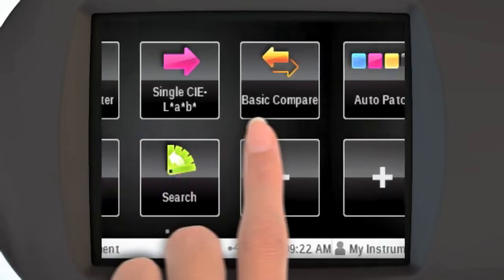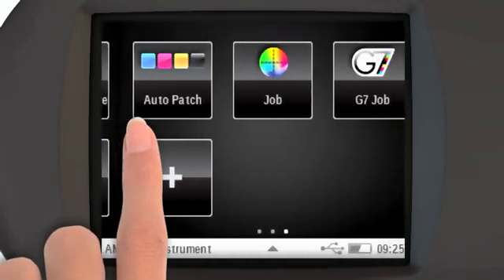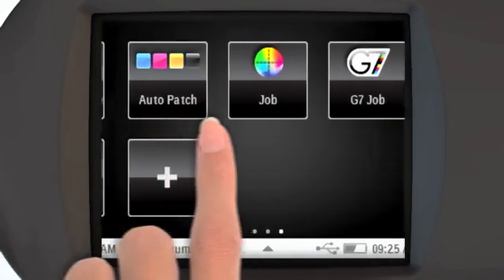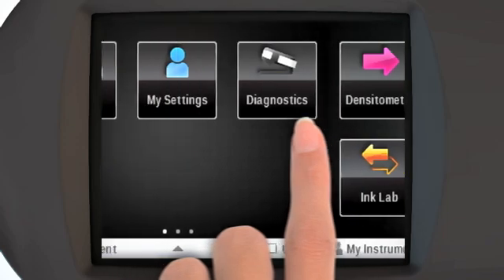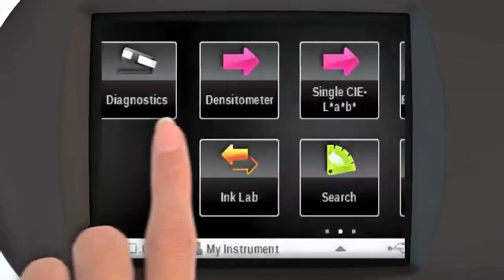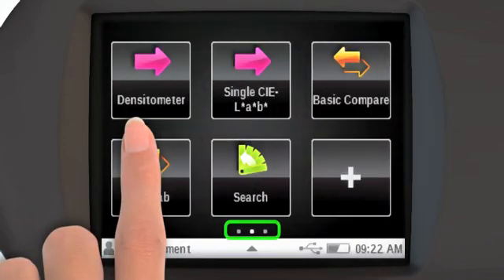Swipe right to see additional tools or left to view preferences. These dots represent the number of screens and where you are. Right now, we are in the middle of three screens.